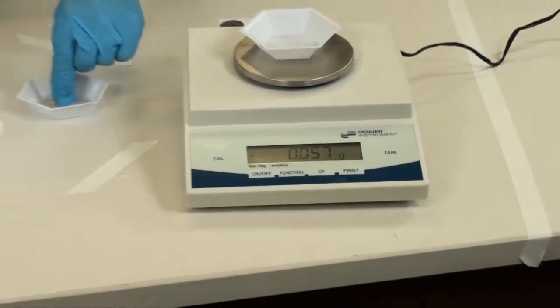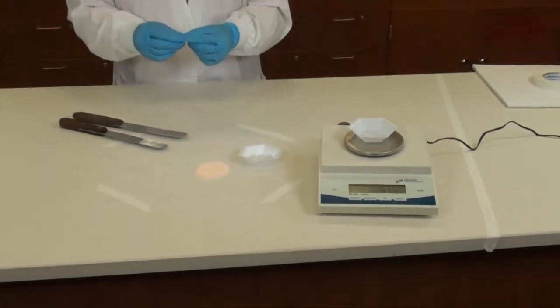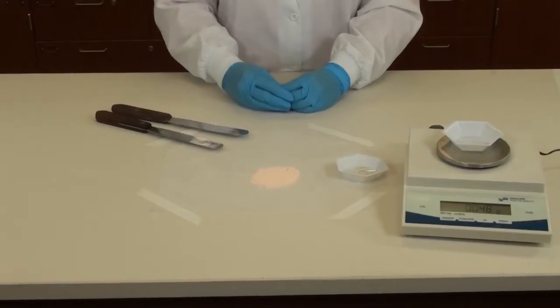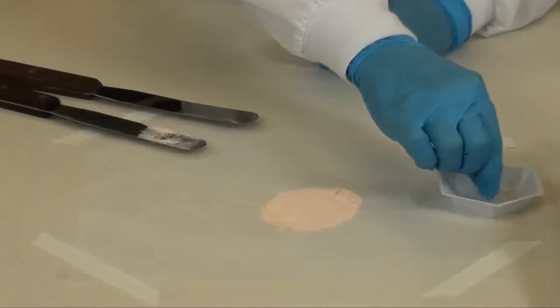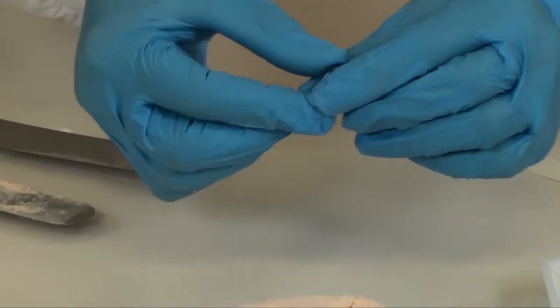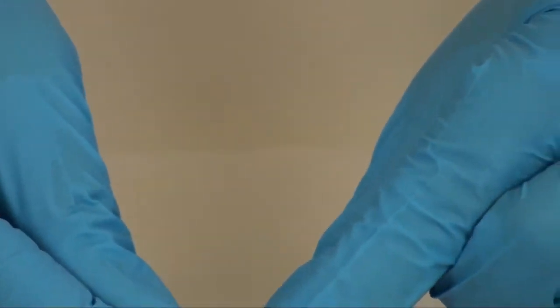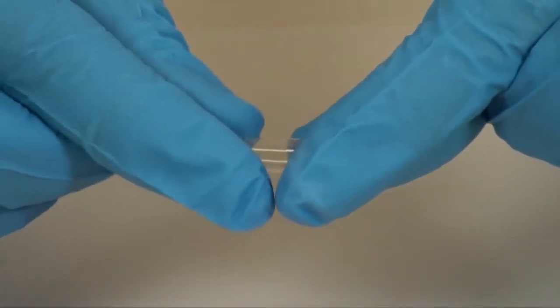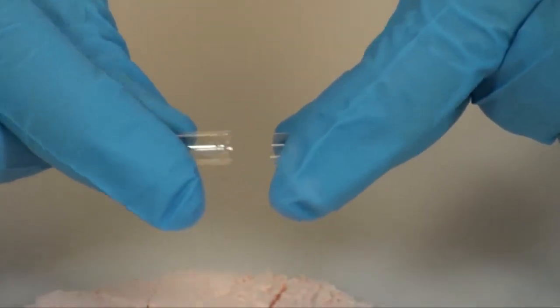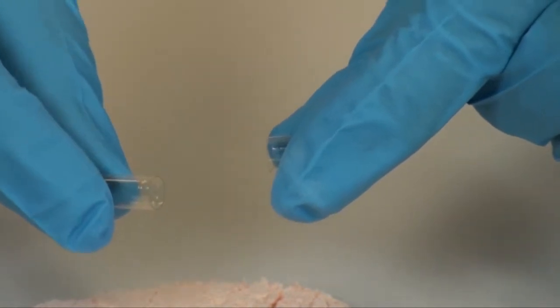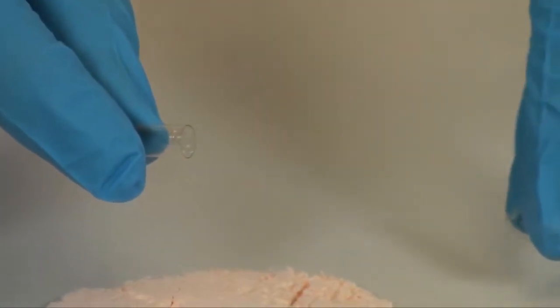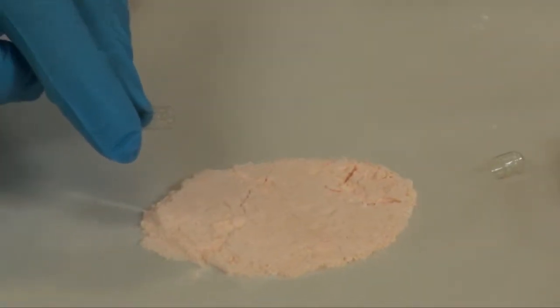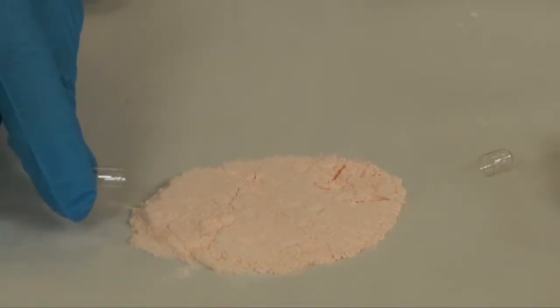You are now ready to punch a capsule. Get an empty capsule and remove the body from the cap. The body is the longer portion and the cap is the shorter. Place the cap on your ointment paper and use the body to fill the powder.